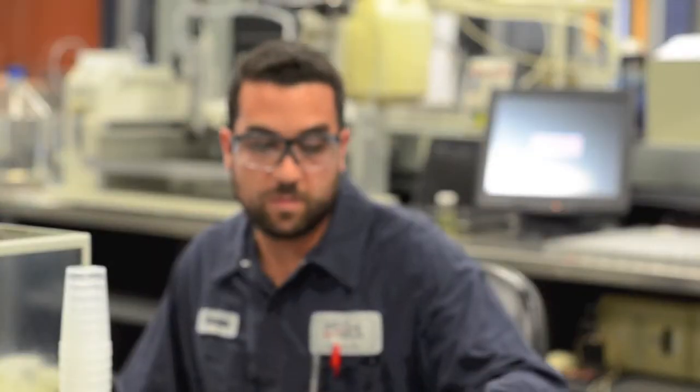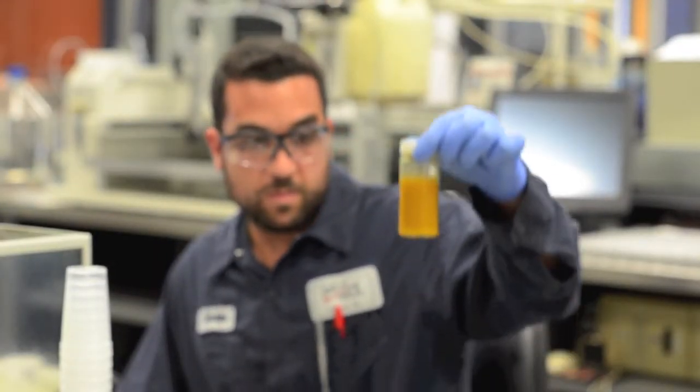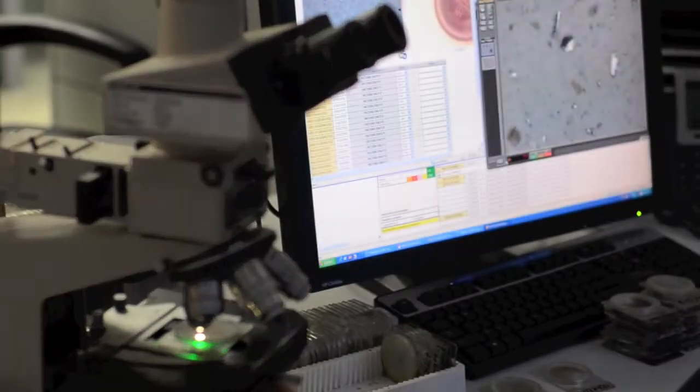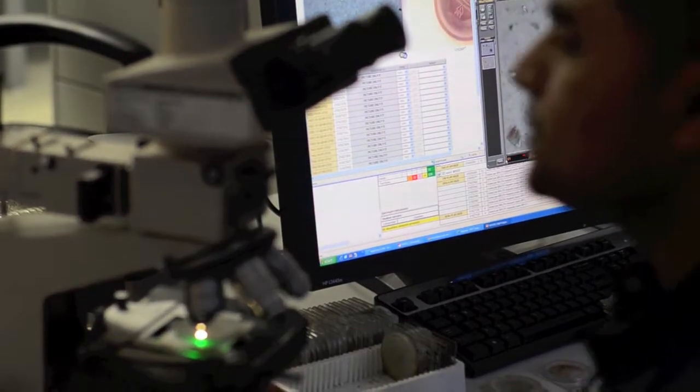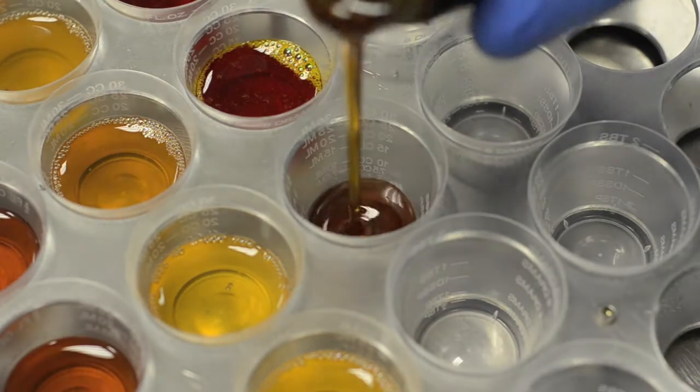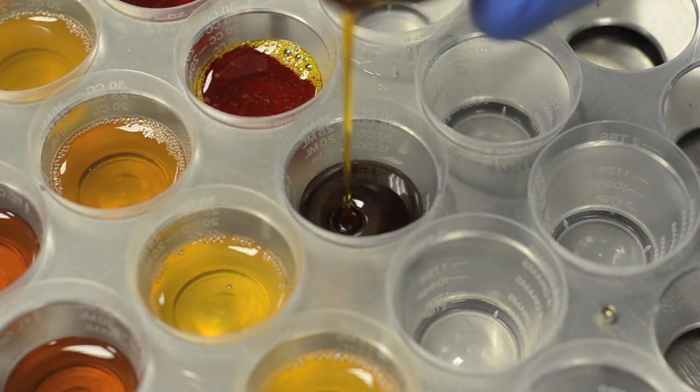What I was most impressed with about the instrument is that we can now process all samples for particle count that traditionally we couldn't, whether there was too much water in the sample, or whether there was just too much gross contamination, and those samples typically would have had to go for a particle patch. Today we can analyze every single oil sample for particle count, no exceptions.